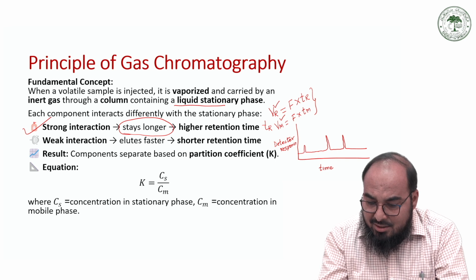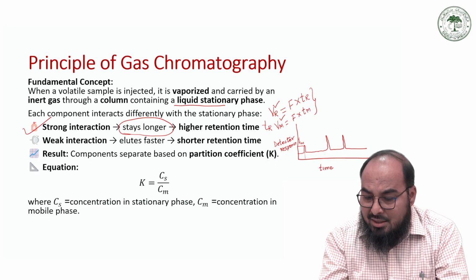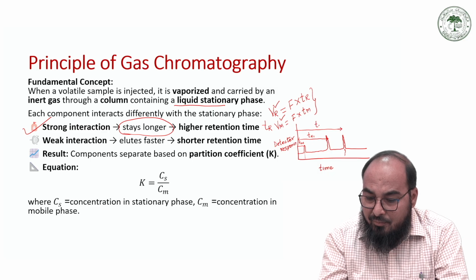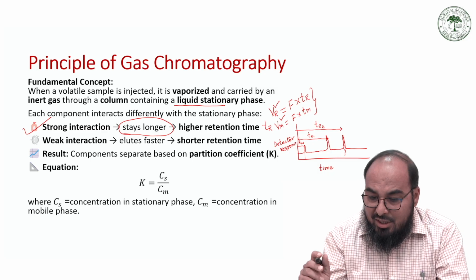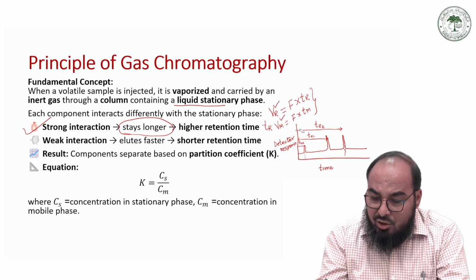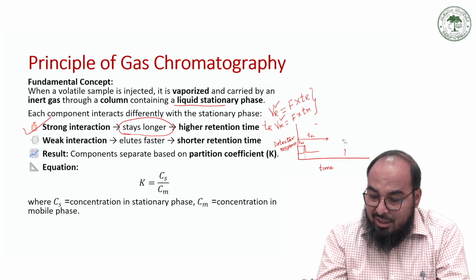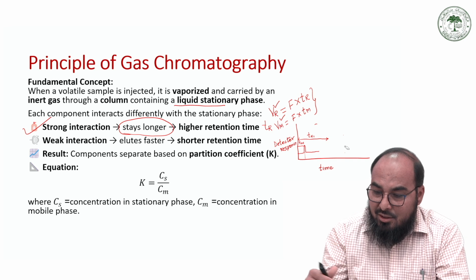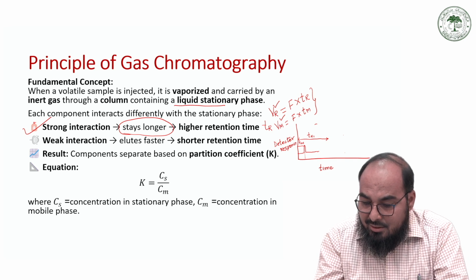If you drop a perpendicular, this distance was TM, and this distance was called TR1 and this one is called TR2 for a two component system. For example, if you have a single component, then you can erase this line, and simply you can have it like this.